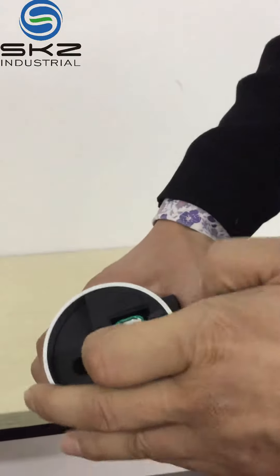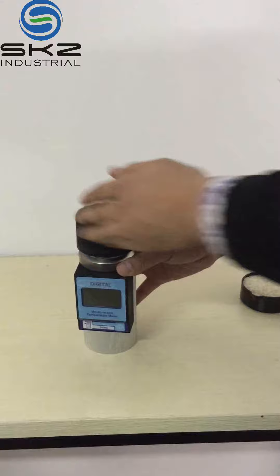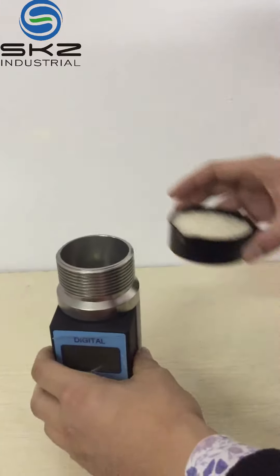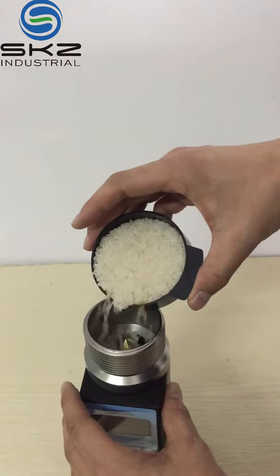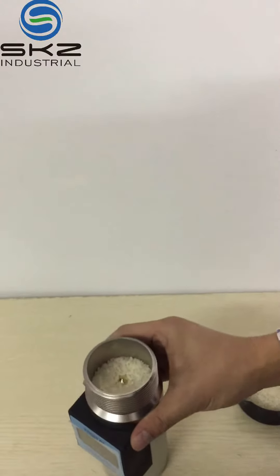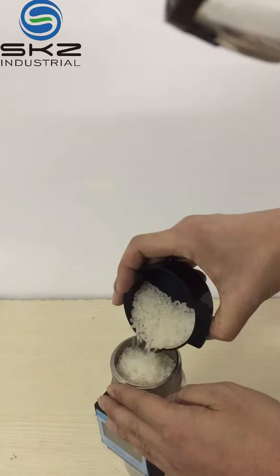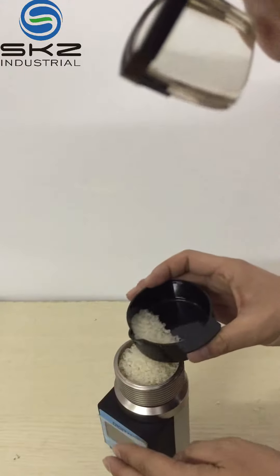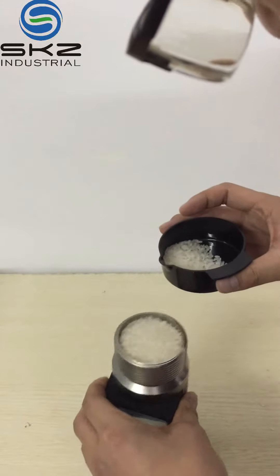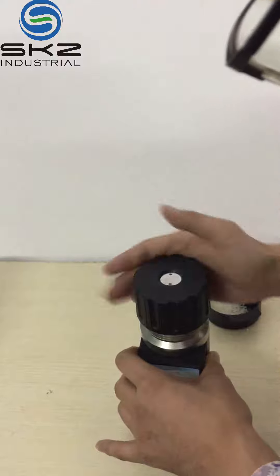First, place the battery in. Then remove the cover. Fill the sample. Make it tightly. Then fix the cover.